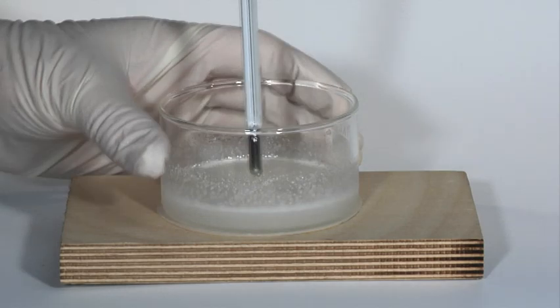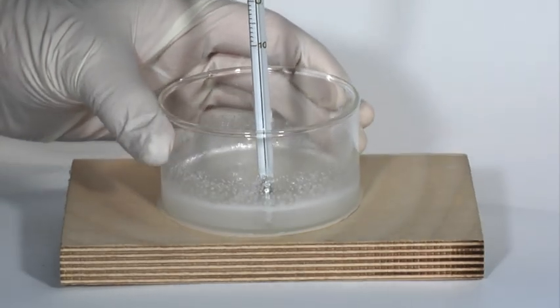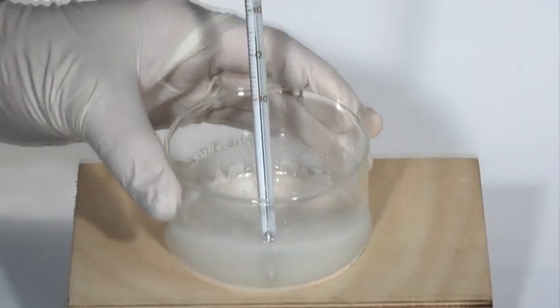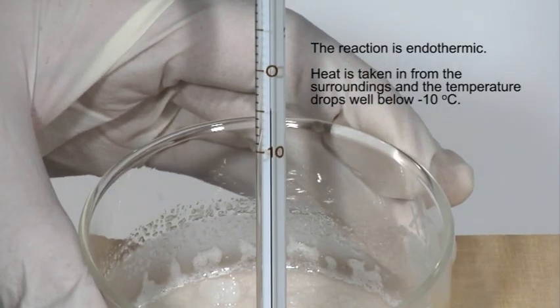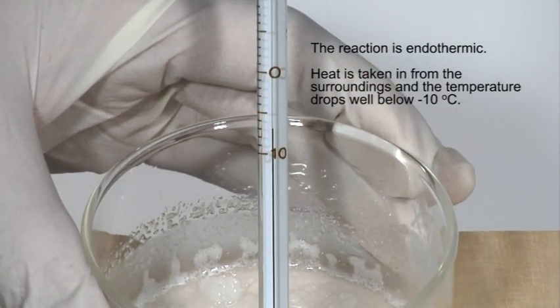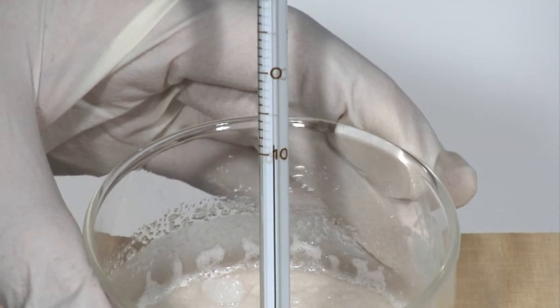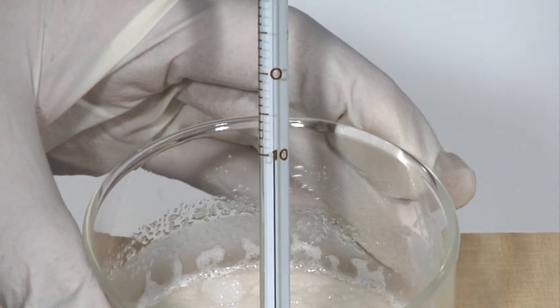In this reaction the water of crystallization in the barium hydroxide crystals is liberated at the same time as ammonia is formed. This gives rise to a large number of product molecules and consequently a large increase in entropy.